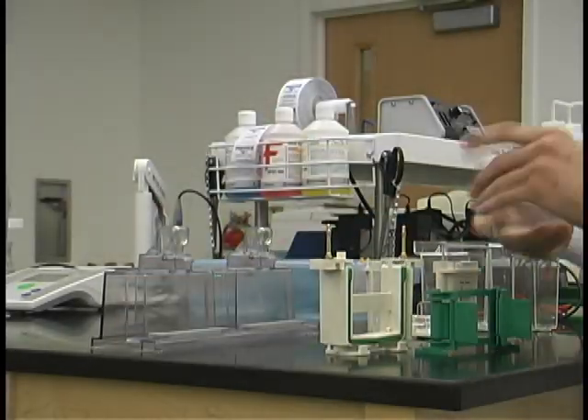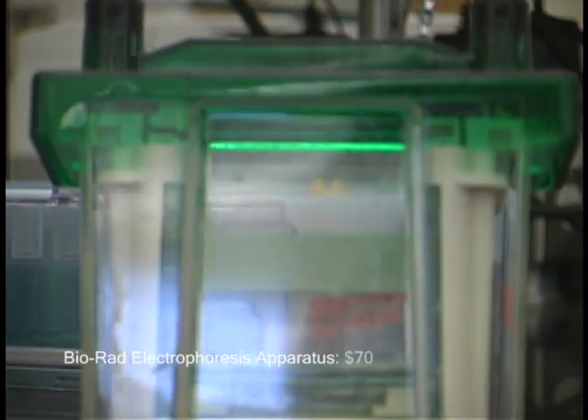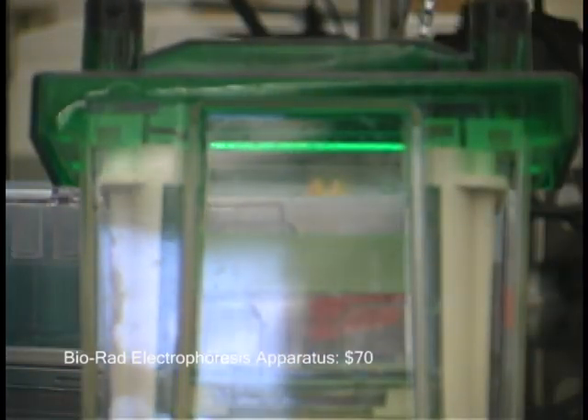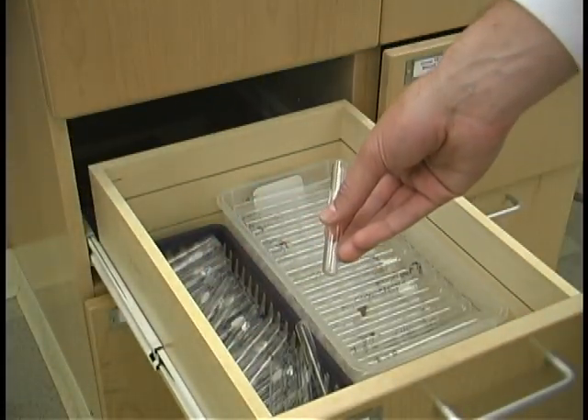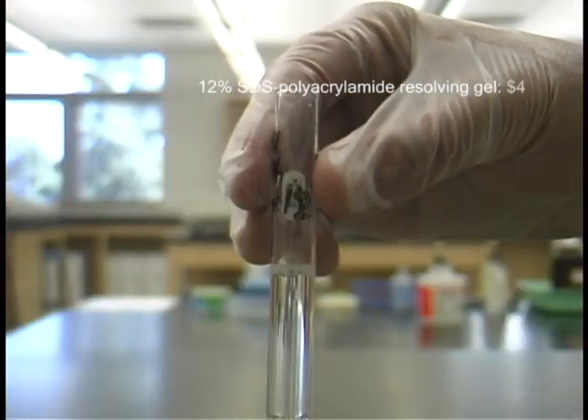Bio-Rad Electrophoresis Apparatus: $70. 12% SDS Polyacrylamide Resolving Gel: $4.